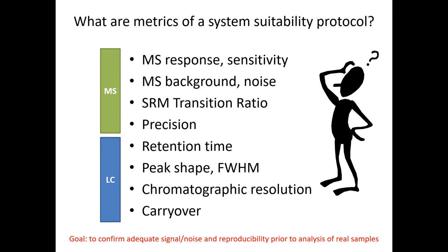So for the chromatography, reproducibility of retention time is very important. And not just reproducibility, but the absolute amount. If all of your peaks are coming out 20 minutes later than that same method run in your friend's lab, then something may be wrong and the system is not running optimally. Even if they're reproducible, they also have to make sense in the context of the method.